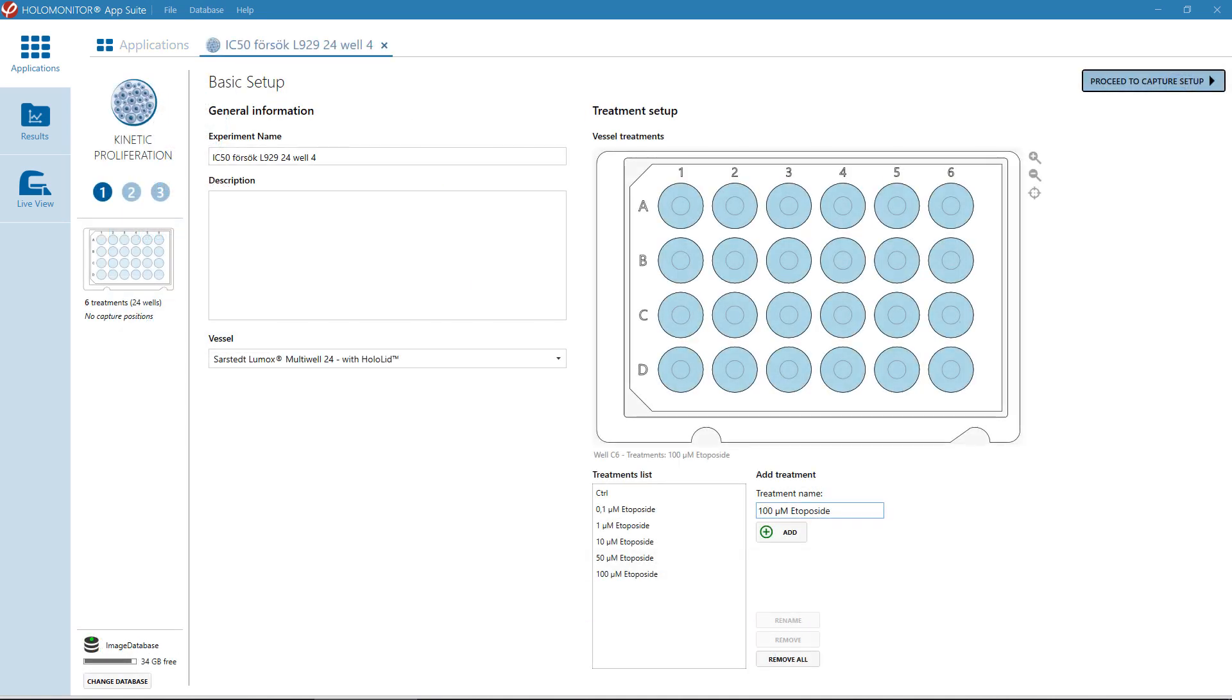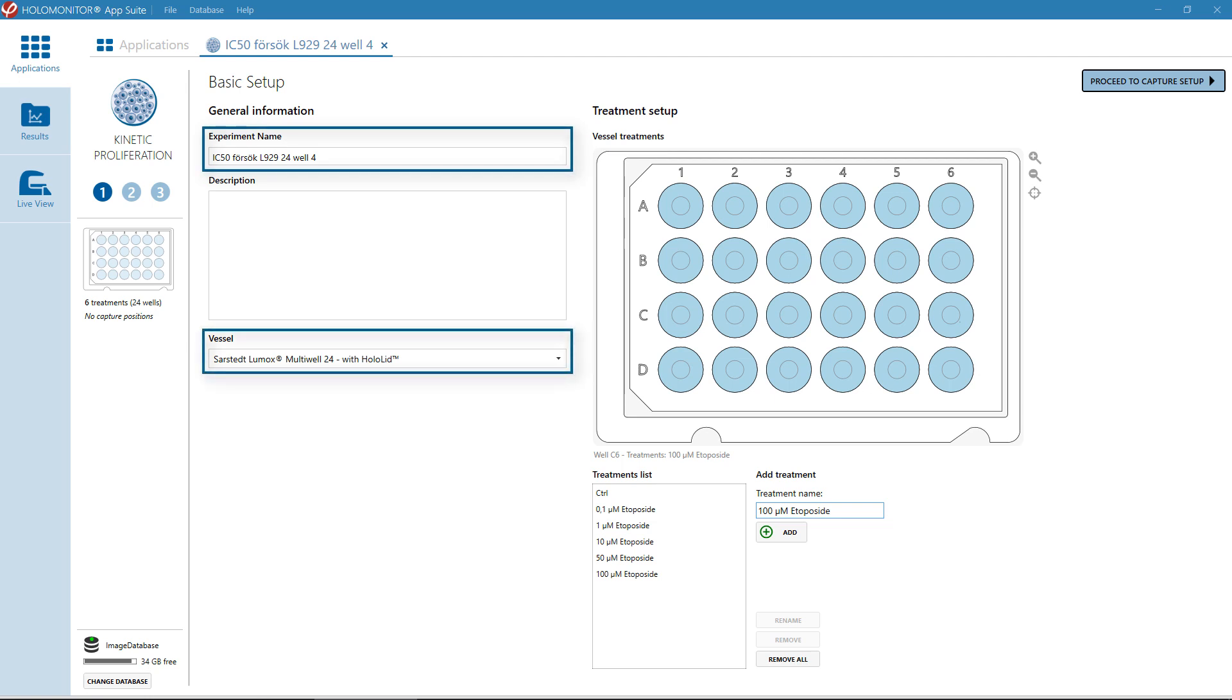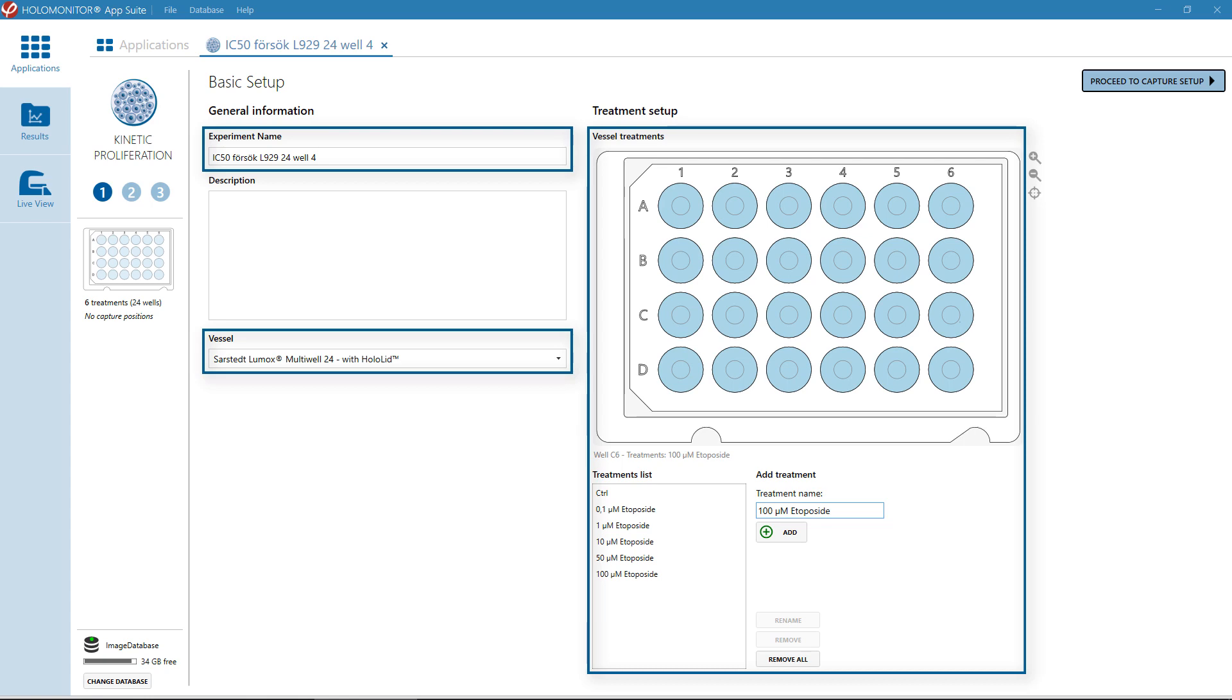Then, go to Basic Setup to select experimental name, which vessel to be used, and which kind of conditions and treatment that apply for each well.